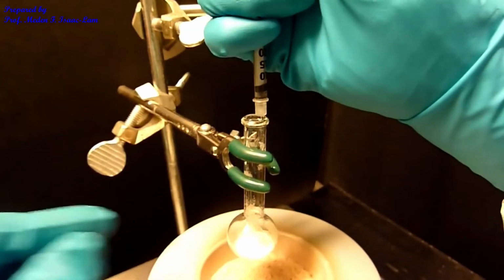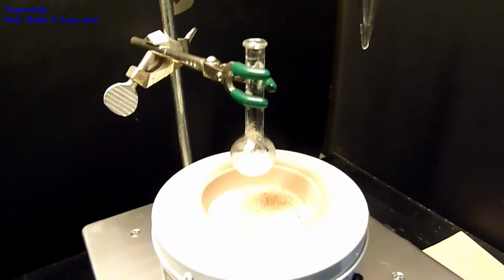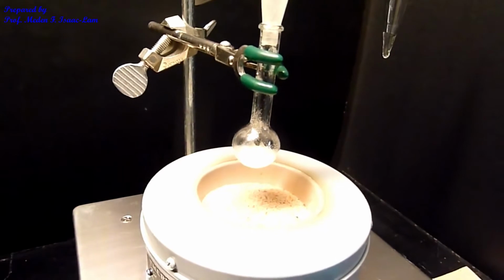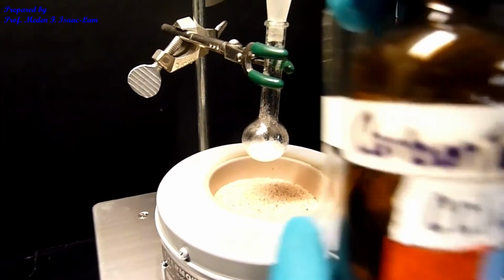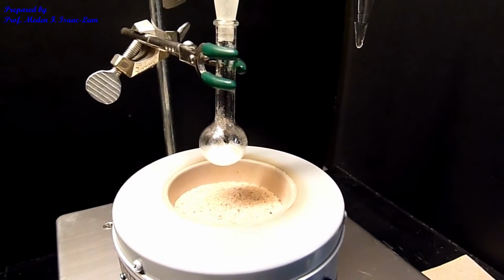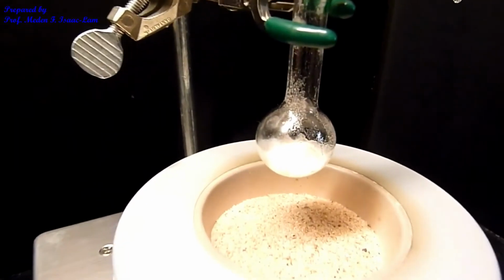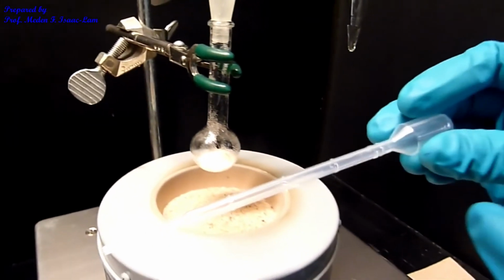So I got everything in. And I'm going to rinse this with the solvent. So the solvent is carbon tetrachloride. So carbon tet is the solvent. And so it's about 0.8 ml. And I'm just going to approximately use this graduated pipette.